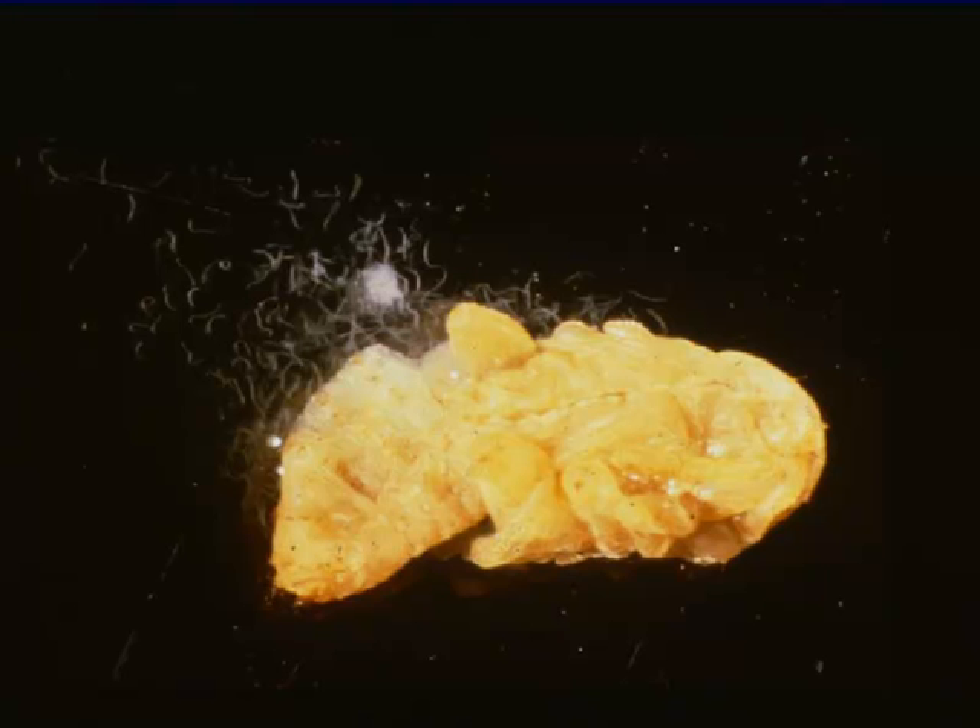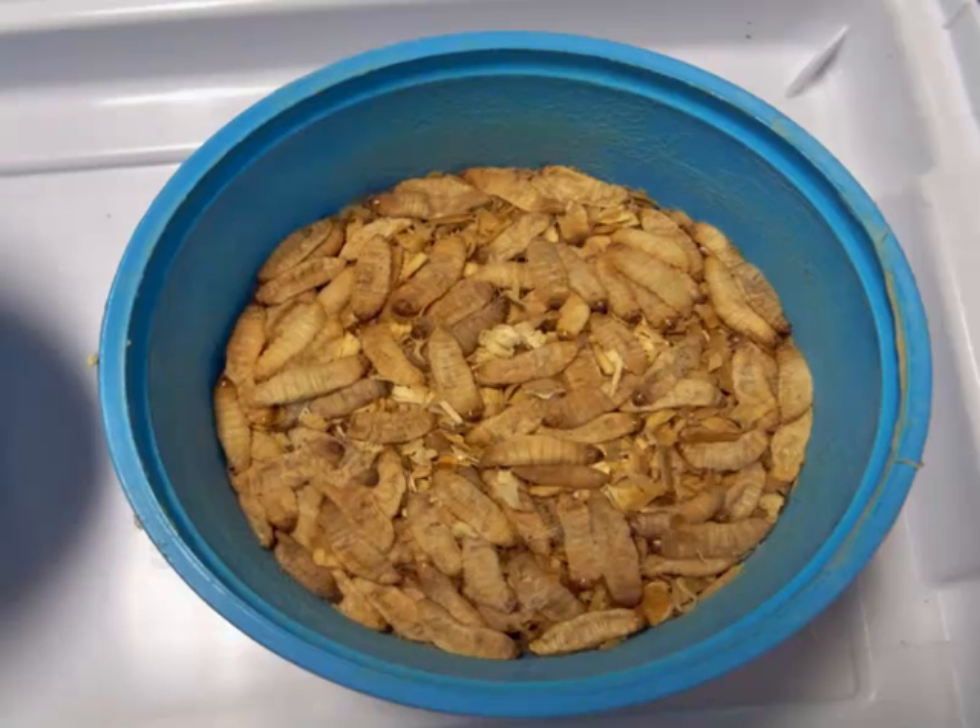The nematode stage released from host insects in the lab rearing process, or from alfalfa snout beetle larvae or grubs in the field, are called infected juveniles, or IJs. Once IJs emerge in your cup, you will notice a yellow film on the sides of the cup as well as near the top. Nematodes also will clump together and look like a yellow film along the edges or rim of each cup.